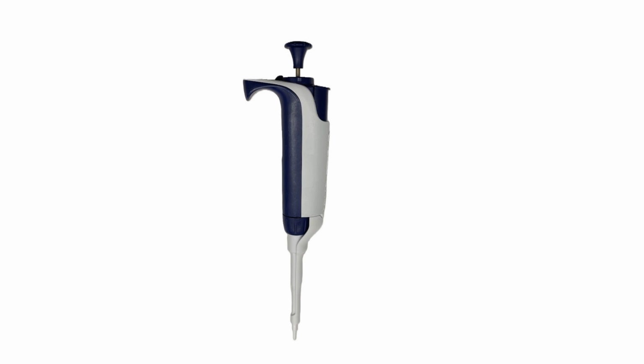Here is an example of a micropipette. At the top is the plunger, which controls the airflow in and out of the pipette by pushing the plunger down to one of two stops. The plunger is also typically where the volume is adjusted. The tip ejector button controls the tip ejector mechanism below the body of the pipette, which discards the tip after use.